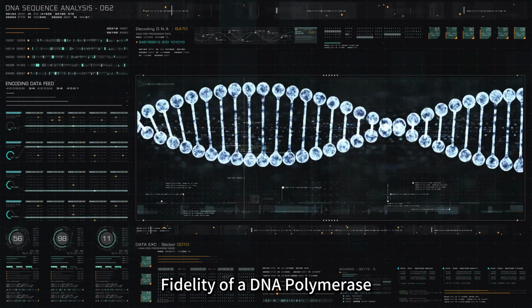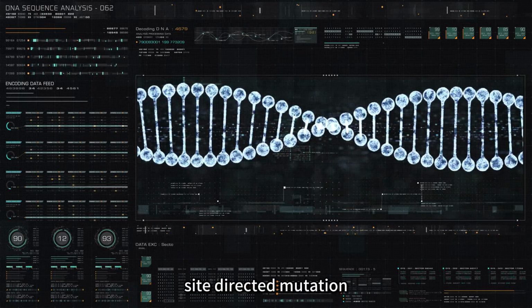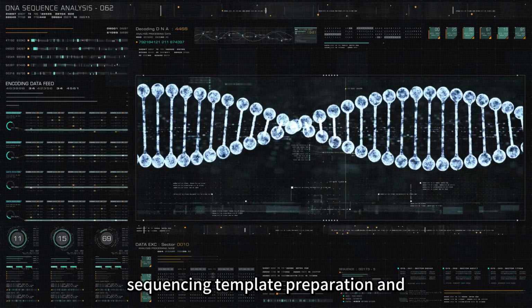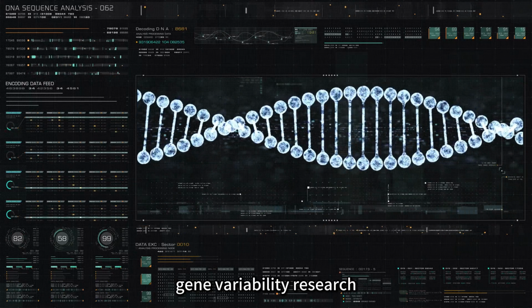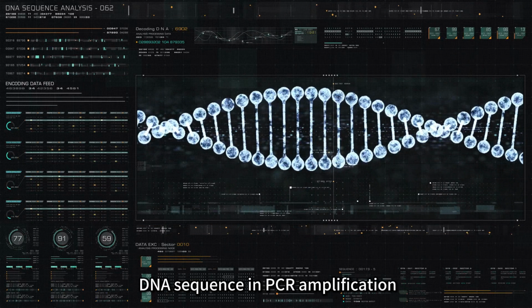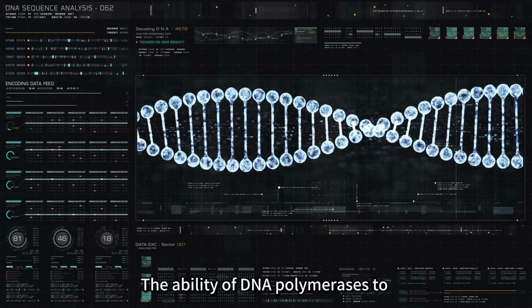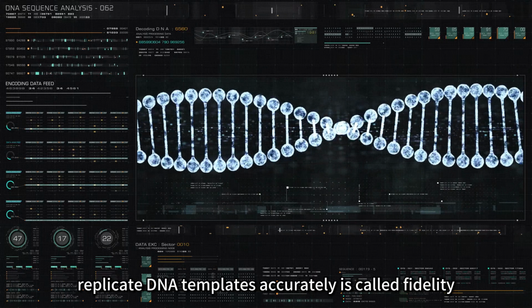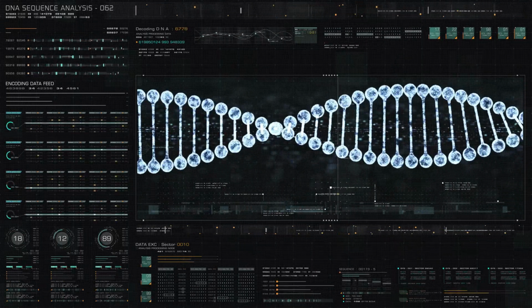Fidelity of a DNA polymerase. In the application of cloning, site-directed mutation, sequencing template preparation, and gene variability research, it is very important to maintain the accuracy of DNA sequence in PCR amplification. The ability of DNA polymerases to replicate DNA templates accurately is called fidelity.